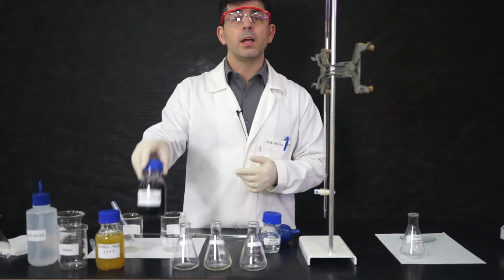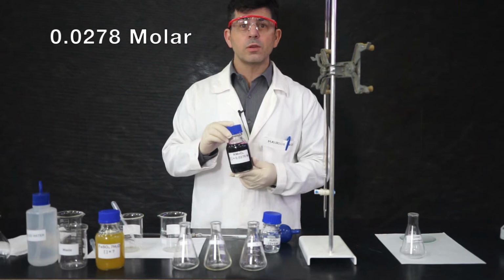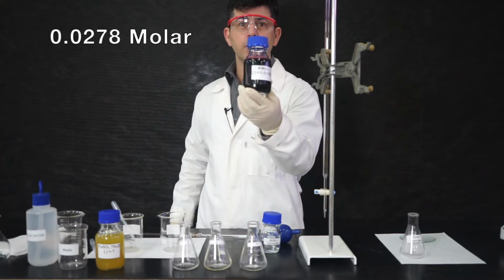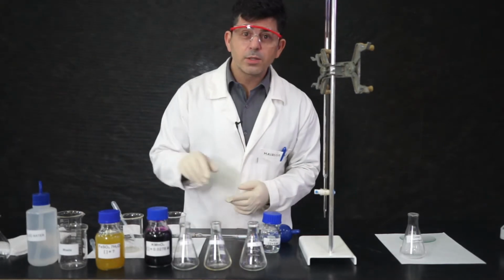Erasmo prepared a solution of potassium permanganate. You will need to know the exact concentration of the solution. Assume you have no uncertainty. This is the concentration of potassium permanganate you have. Okay? I guess we're ready to start.